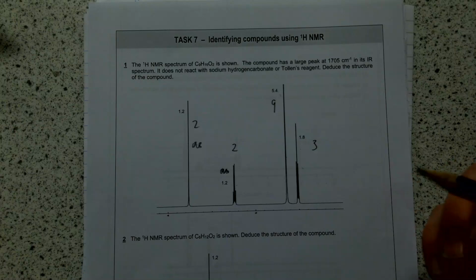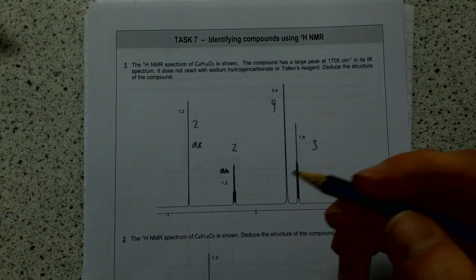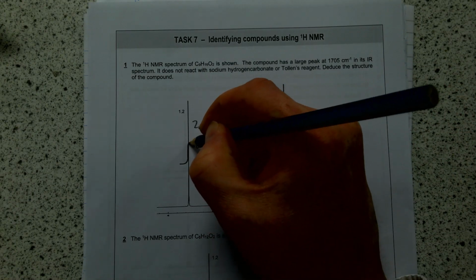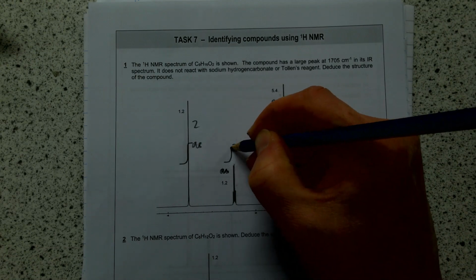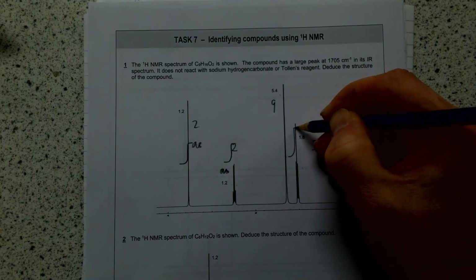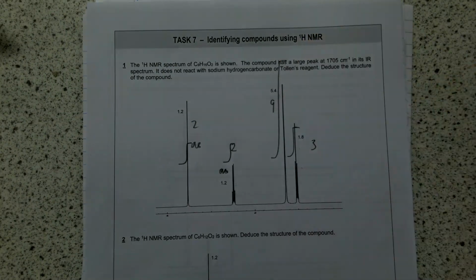The way that you might see it on your exam papers, folks, though, and in the packs of questions you're going to do shortly, this is as an integration trace, which will look like that. So that height must be the same as this one. They're a 2 to 2 ratio. This one over here is going to be 1.5 times the size like this one. This one's going to be 3 times the size of that one, so it's going to look like that. So you get these integration traces that look like kind of S's with vertical bits on them. So that's the integration traces.